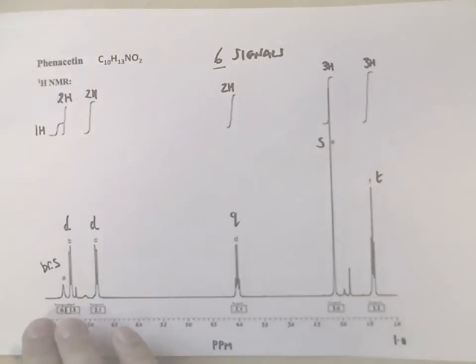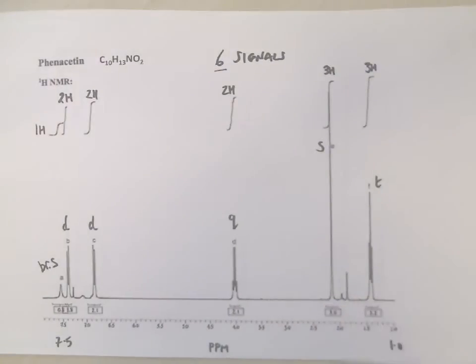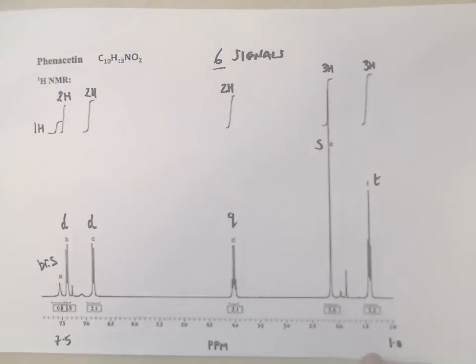And then we also have the chemical shift to consider. Here we have 3 proton environments around 7 ppm. We have a proton environment around 4 ppm, and then we have a proton environment around 2 ppm and one just under 1.5 ppm. So what does that tell you?